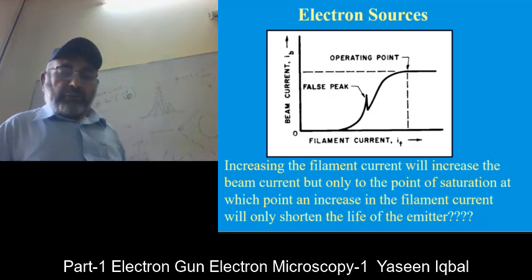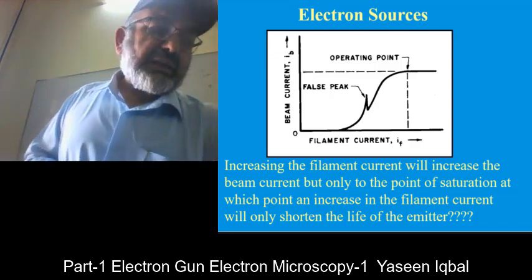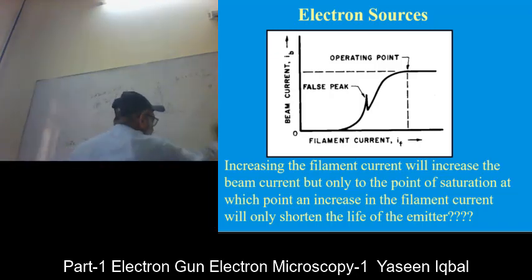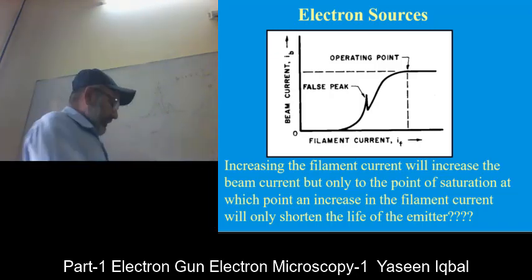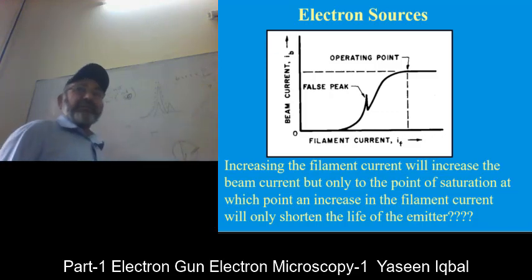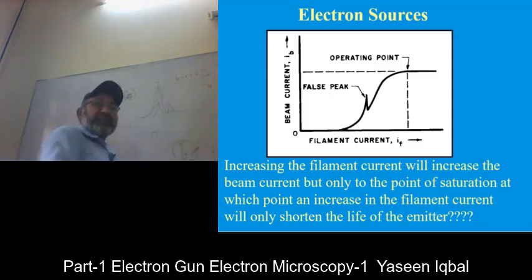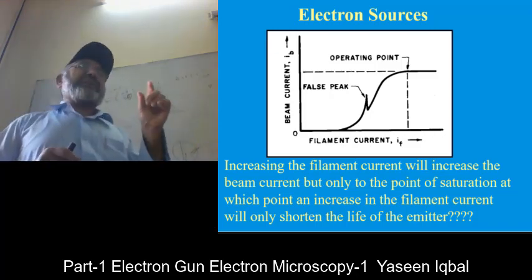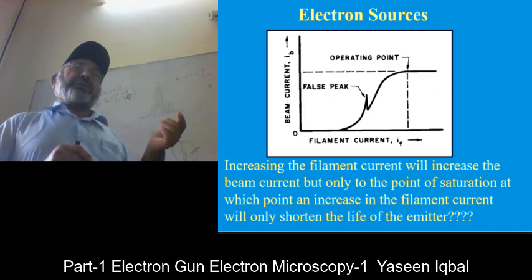Usually, the knobs on an electron microscope show this: if this is a knob and this is the moving part, they draw a red line here. This means you shouldn't exceed this, because the tip is in nanometers or micrometers.